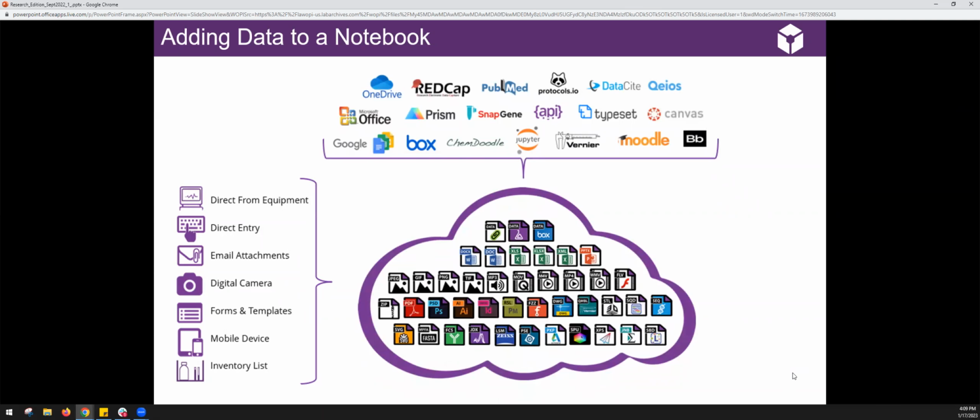All these attachments, files, notes, observations, you can see in real time, you can share amongst your team and update, see what's going on, and you can also export. We provide several export formats for you all. We'll go into more detail on this towards the end of the presentation today, but you can always get the data back out. In good practice, in reproducibility, and good science, one of the most important things is making sure that down the road, you can get that information back out of your system.